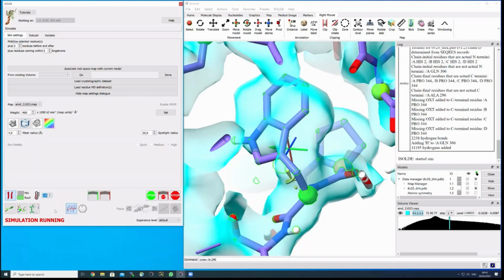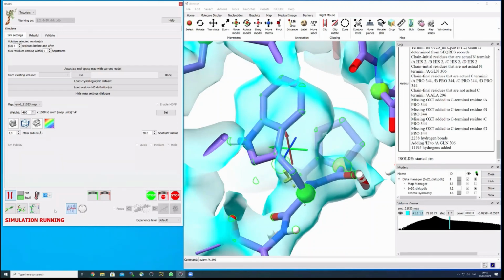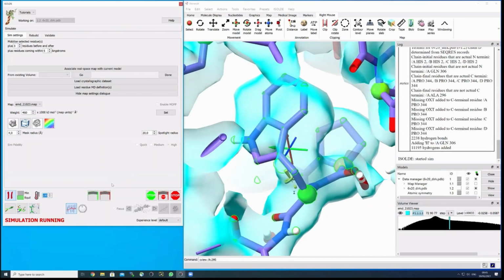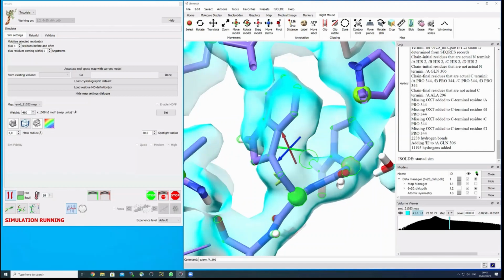Personally, I prefer working at lower temperatures, which gives me the feeling of having better control. So I would reduce it now to 10, which is typically what I'm working with. So things aren't moving that much, but you can even go lower than that.